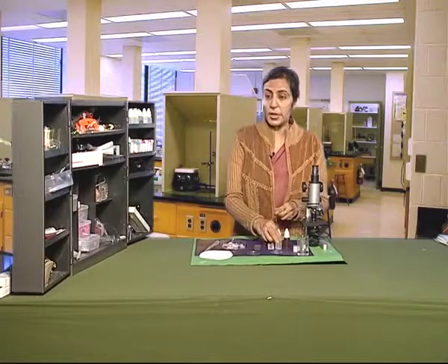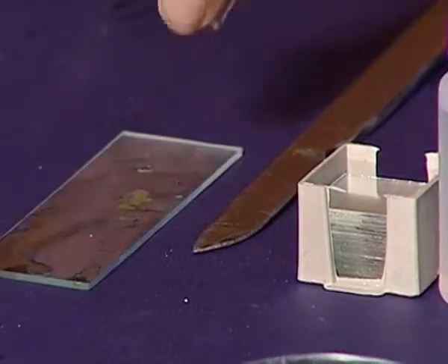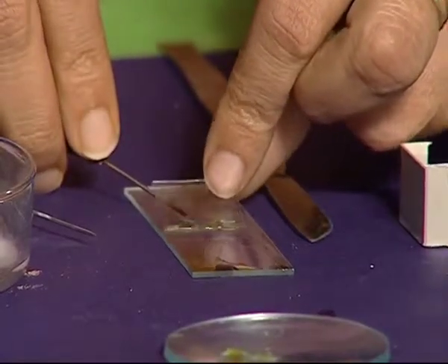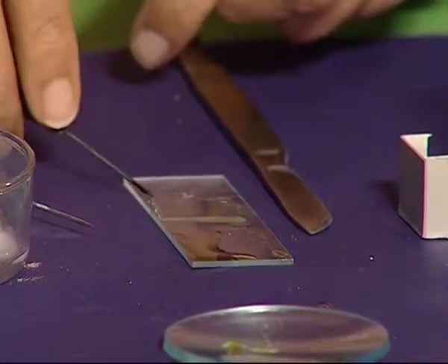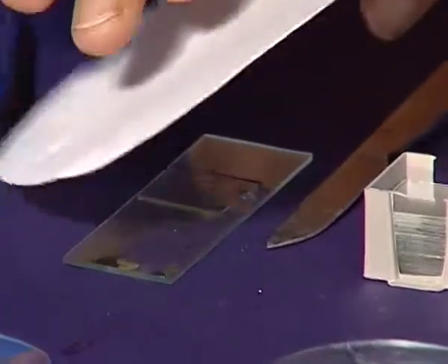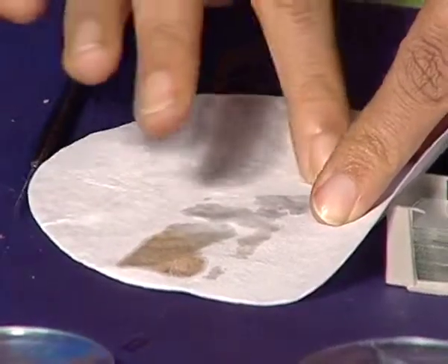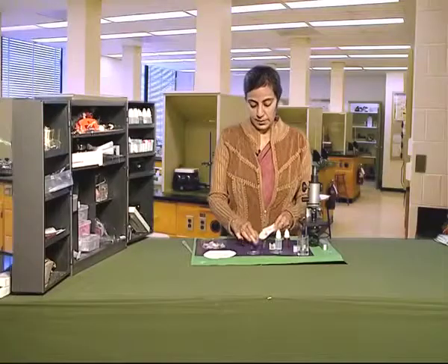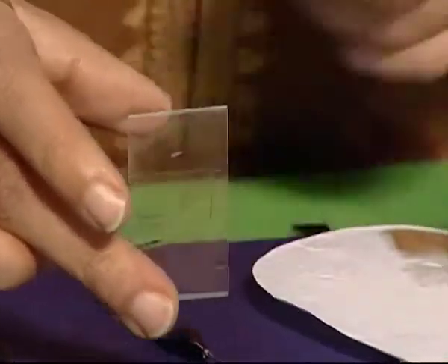Put the cover slip very gently over the peel. Ensure that air bubbles do not enter under the cover slip. Blot the extra material from the slide. Your slide is ready.